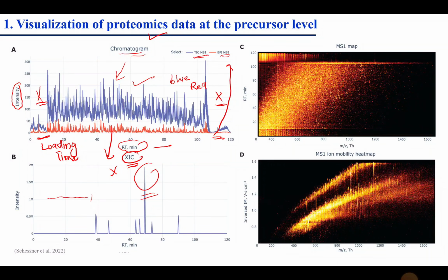Later on I will discuss how we do this. So other things are the same. Here you can see intensity and here is retention time, where we keep only a few curves and neglect the other curves, so it is called an extracted ion chromatogram.